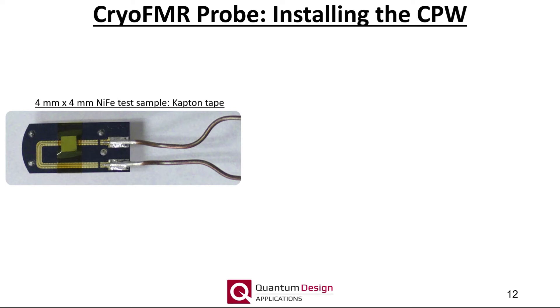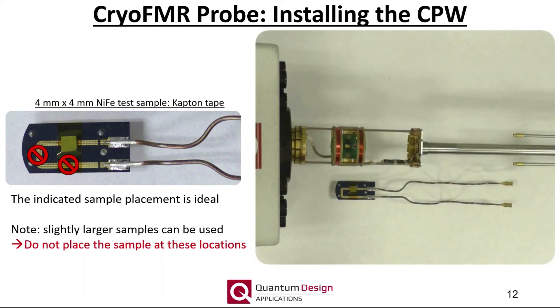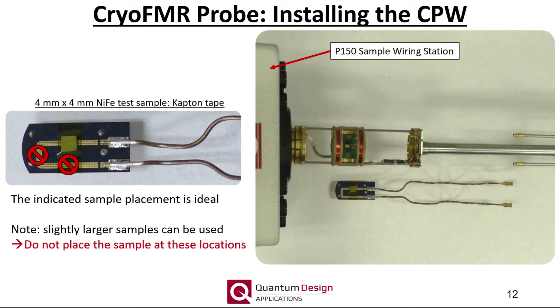Let us now mount a sample to the coplanar waveguide. We find the best method is to simply tape the sample to the coplanar waveguide using Kapton tape, as shown here for the included 4 mm by 4 mm permalloy test sample. The indicated placement is ideal, and slightly larger samples can of course be used. It is important to make sure not to cover these portions of the coplanar waveguide, however. This video will demonstrate installing the coplanar waveguide into the cryo-FMR probe. Note, it is incredibly useful to use the P150 sample wiring test station to hold the cryo-FMR probe in place, so that it does not roll around on your desk or work surface. Also, just for completeness, here is the location of the calibrated CERNOX thermometer.